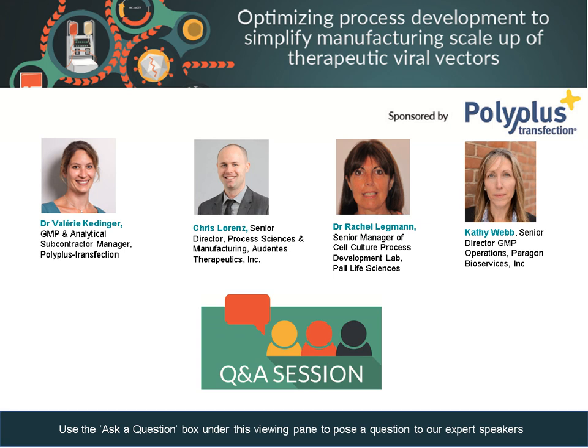And for both steps, we're really convinced that the establishment of a good supplier-manufacturer relationship is key, because during initial process development, the safety and the quality of the raw materials can sometimes have a low priority since at that point it's not intended for clinical administration. But now more and more manufacturers are becoming aware that they need to anticipate as early as possible to make sure that they're not going to have to change the sourcing of raw materials later on in their process because of, let's say, lack of the quality grade, of consistency in manufacturing, or of regulatory support to meet the demands of the regulatory agencies.